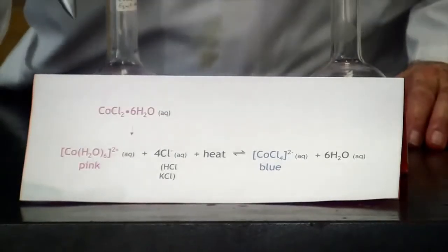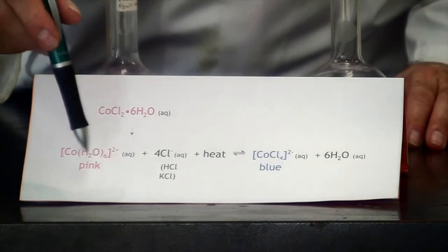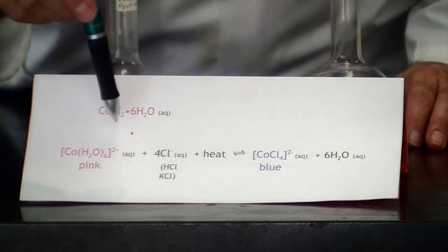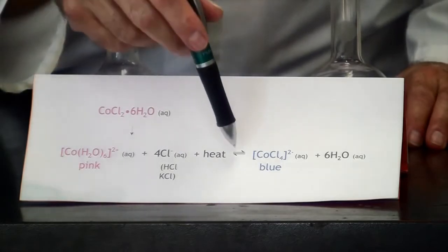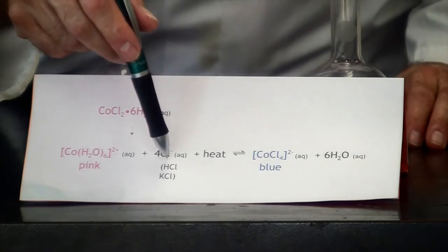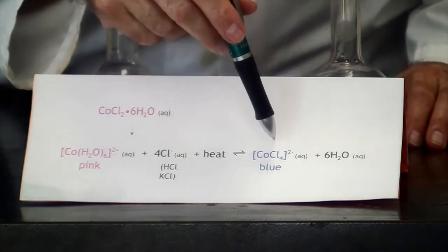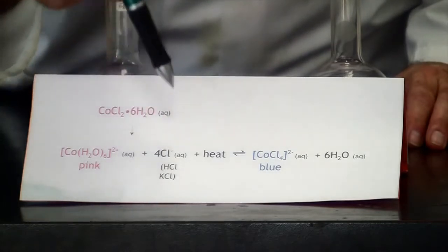Let's look at the equation here. You can see that the cobalt surrounded by water gives us the pink color, and according to Le Chatelier's principle, in this equilibrium if we add chloride in the form of either HCl or KCl we should get a shift to the blue color. So let's try each one.